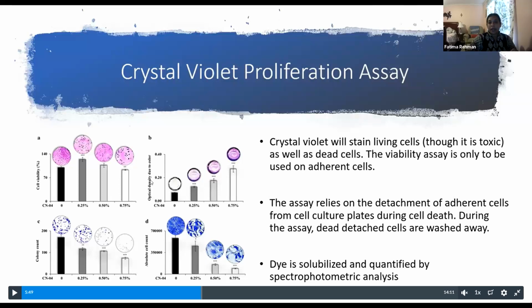The point of that graph was actually it's kind of a proof of concept graph, where they're saying that if we attach this drug to the dye and we are using increasing concentration of the drug, hence increasing concentration of the dye, the optical density will increase. That's all that it's showing at that point. So there's no cells in this culture. You see that right there, just empty wells. It's just showing that the more blue you have, the more absorbance you have. Okay. Mm-hmm.